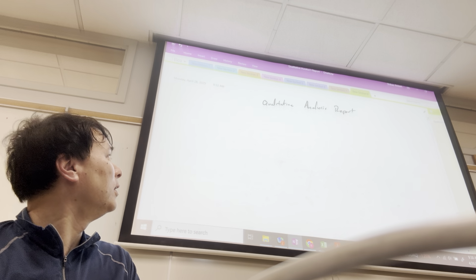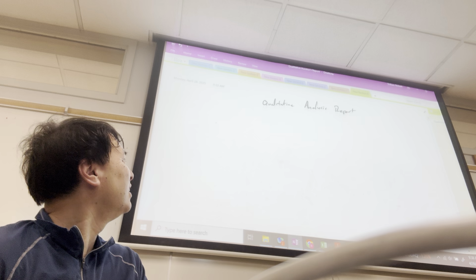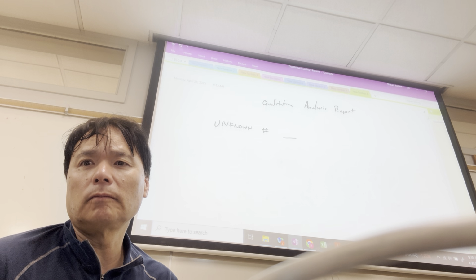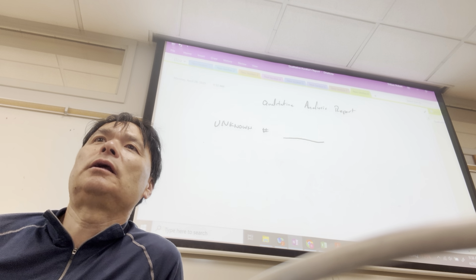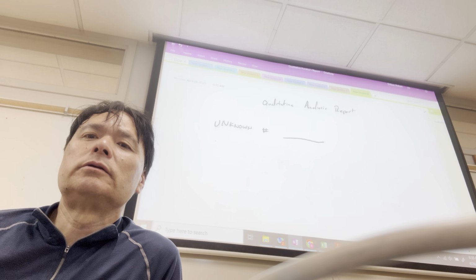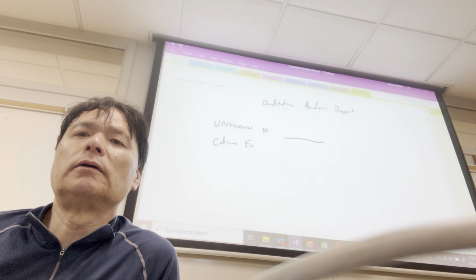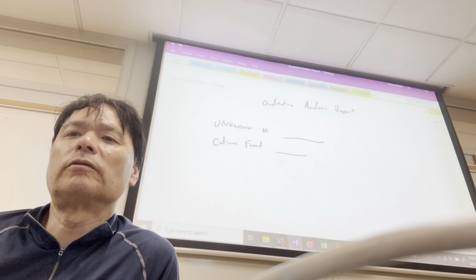Report's going to be kind of simple. What we're going to do is we're going to have the unknown number, and then we're going to just list the cations that you got a positive test for. So cations found, however many.